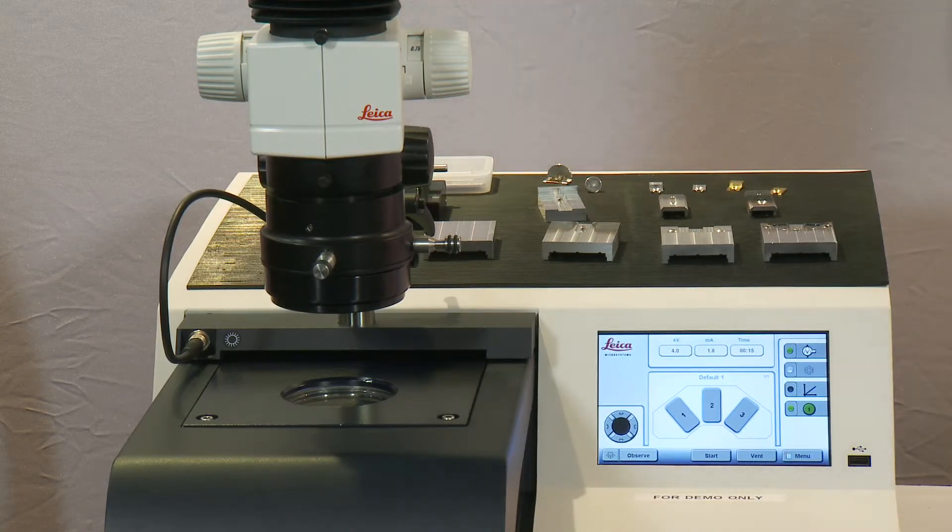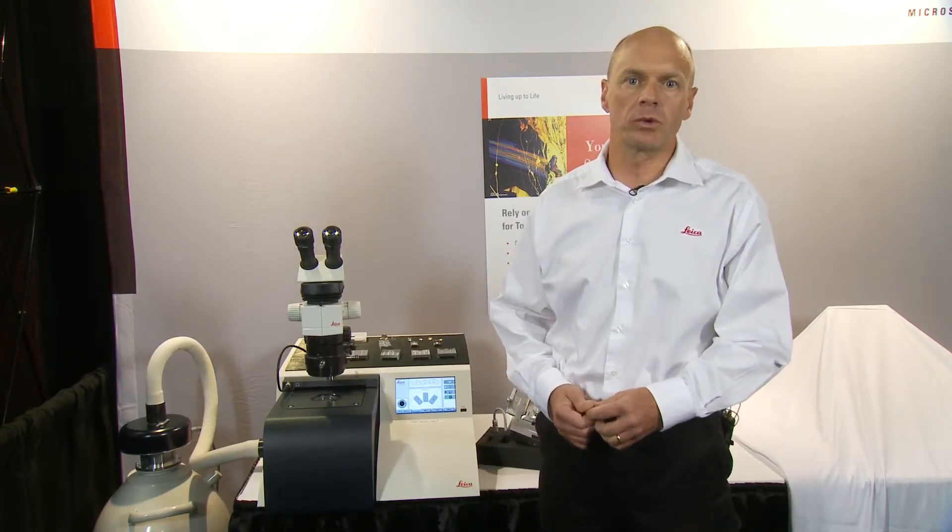The mask positioned in front of the sample prevents the material that you're interested in from being milled away, while everything that projects above the mask is milled away and removed by the ion beams. This permits us to maintain the sample in a fixed position without rotation.